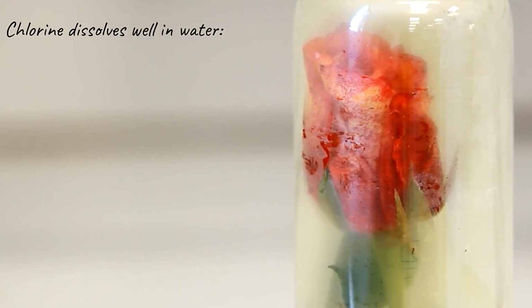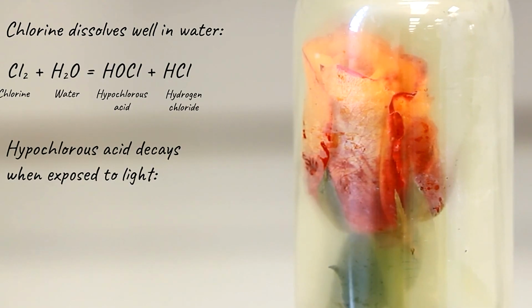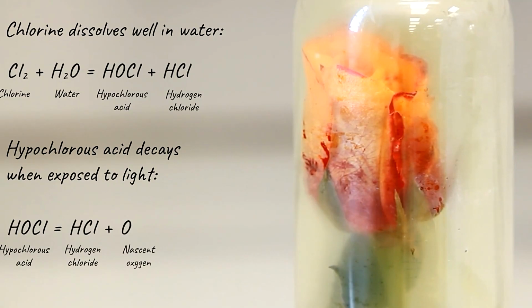Chlorine is well soluble in water, which is present in the petals. The process yields hypochlorous acid and hydrogen chloride. However, when exposed to light, hypochlorous acid decomposes into hydrogen chloride and nascent oxygen.